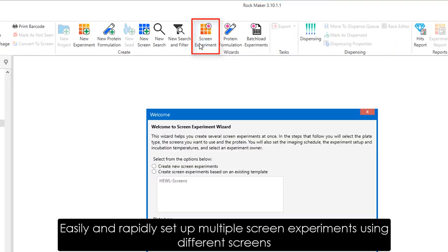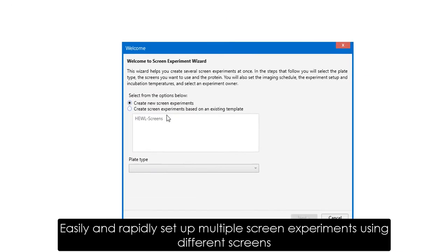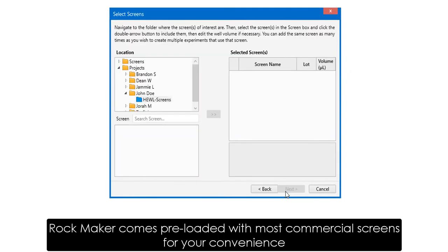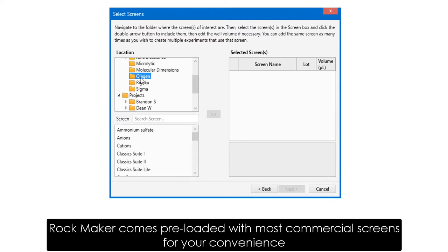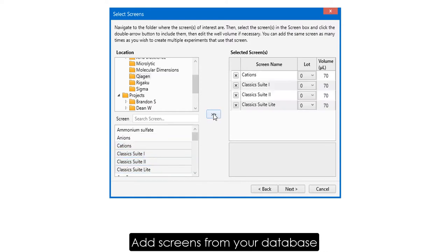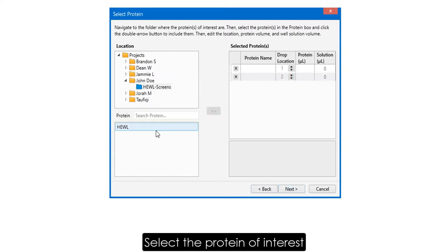In Rockmaker, you can easily and rapidly set up multiple screen experiments using different screens. Rockmaker comes pre-loaded with most commercial screens for your convenience. Just choose your screens from the list, and then select your protein.